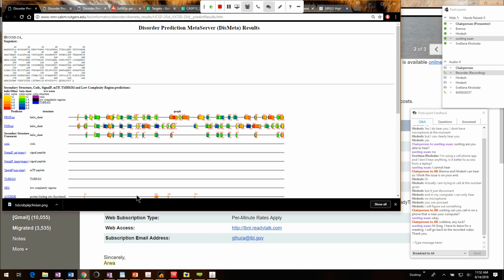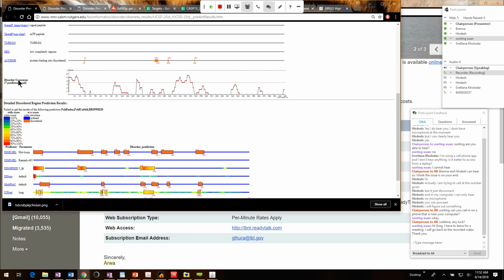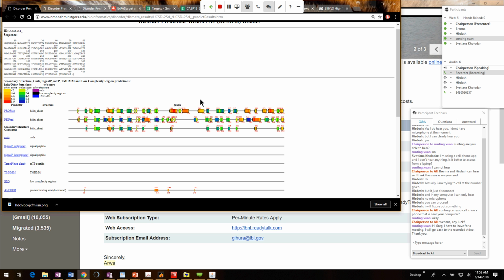So this is the protein that we were just talking about. This is the disorder prediction, and you know, the first 20 amino acids are unfolded, but maybe there's 2 domains or something. So anyway, more information: 410 amino acids, which is approximately 40 kD.